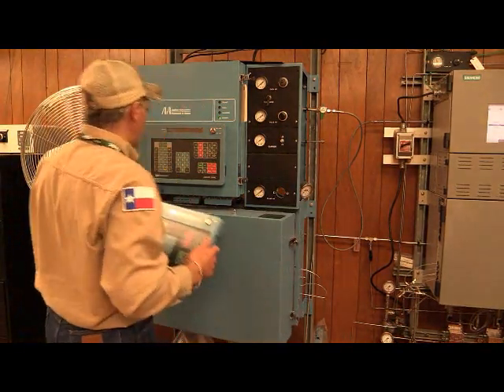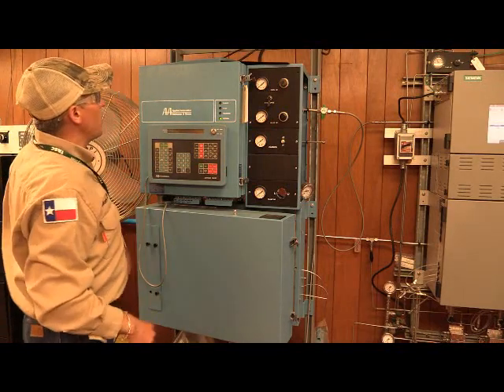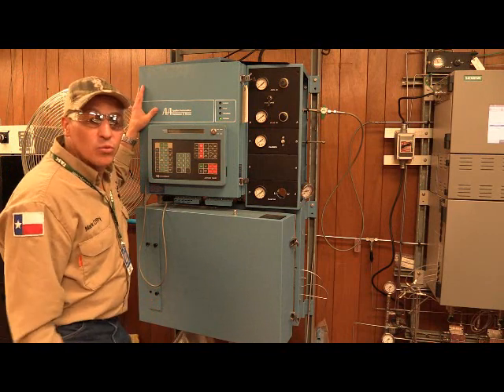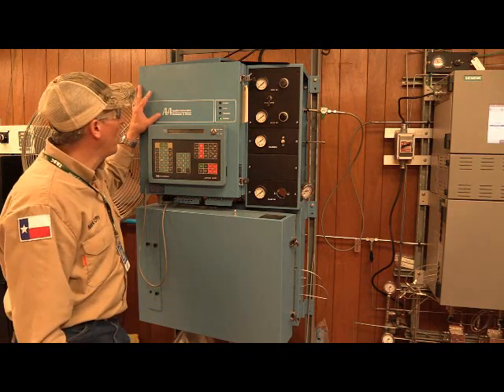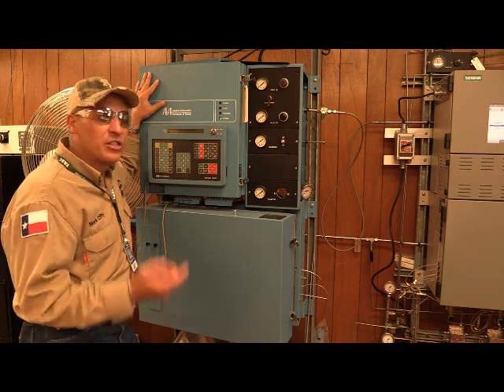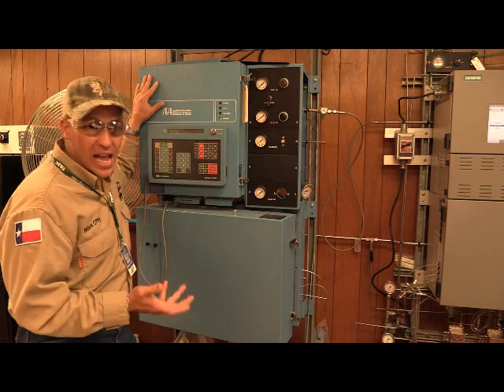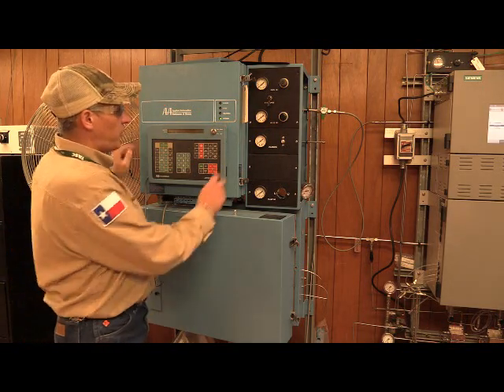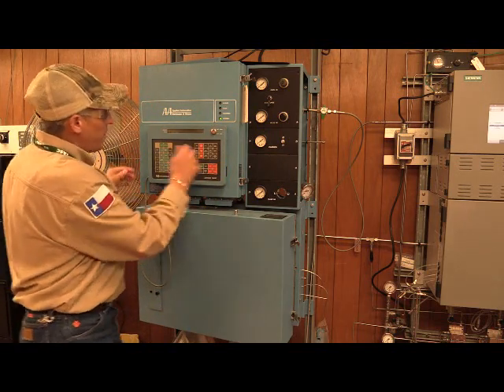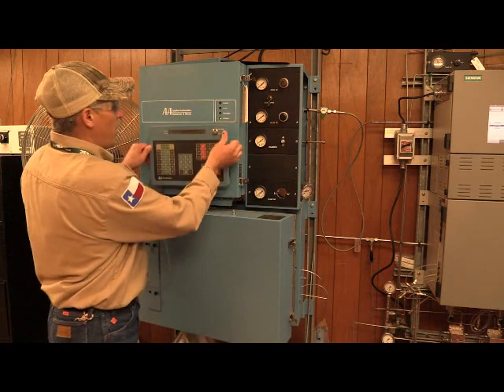This is an advanced Optichrome. This is an older model GC. Applied Automation was bought by Hartmann and Braun, and then Siemens ended up acquiring them, but ABB actually tried to acquire them, but they said it was going to be a monopoly, and they wouldn't allow it to happen. This is a service panel. It plugs in right here, and then it's magnetic. We can pull this guy off, put it anywhere we want.